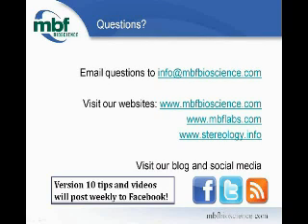So we have a question asking if it's necessary to buy a separate 3D module or if it comes built in with version 10 as default. With version 10, 3D visualization is included, so you no longer have to pay extra for 3D visualization for Neurolucida or Stereo Investigator. We've been asked if we've gotten enough requests for the development of vessel-specific analysis software. Dr. Warrington, please email me. My email is susan@mbfbioscience.com. I would love to talk to you more about that.